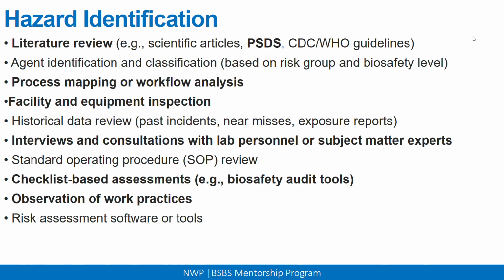That tool is mostly used to give you insight on your hazards and how to do your mitigation. You may want to go online and search for the WHO RUST, which is mostly used in the preliminary phases of your risk assessment.